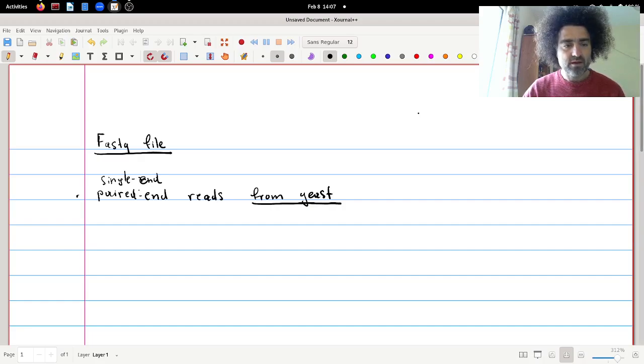If we used a command line tool, then we would change a flag between paired-end and single-end, but since we use Galaxy, all the analysis will be more or less the same. We just tick or untick a button or something like that. Okay, but let's first use Galaxy.